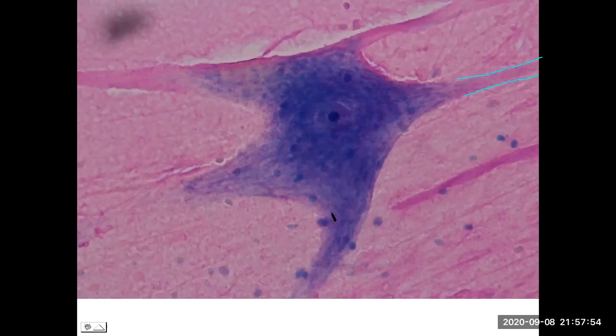And zoomed in, we start to notice these small little dots scattered around. Again, that's just the nucleus of some particular cell known as neuroglia. So a neuroglial cell of some sort, and we can't determine which particular type it is. So just simply the general term, neuroglia.